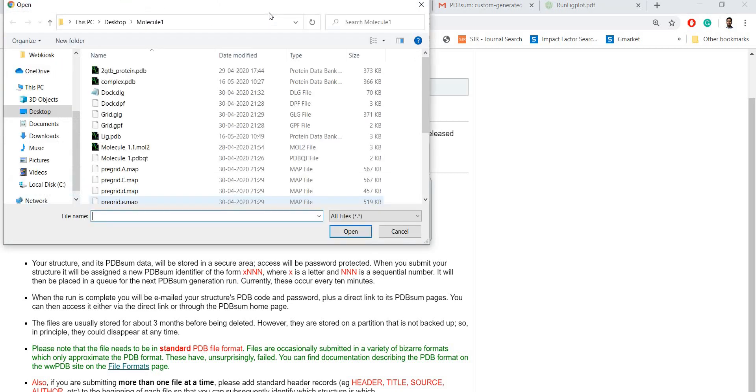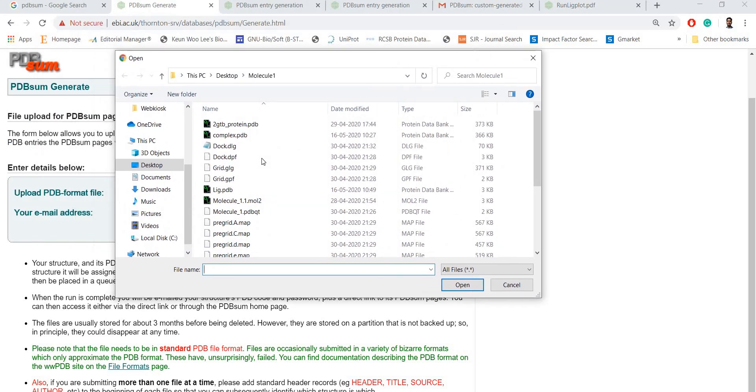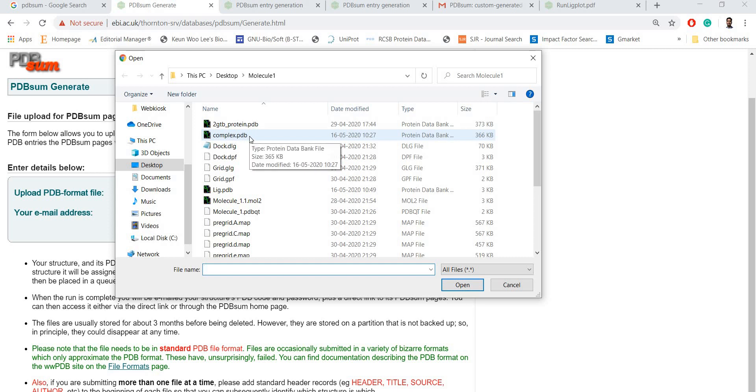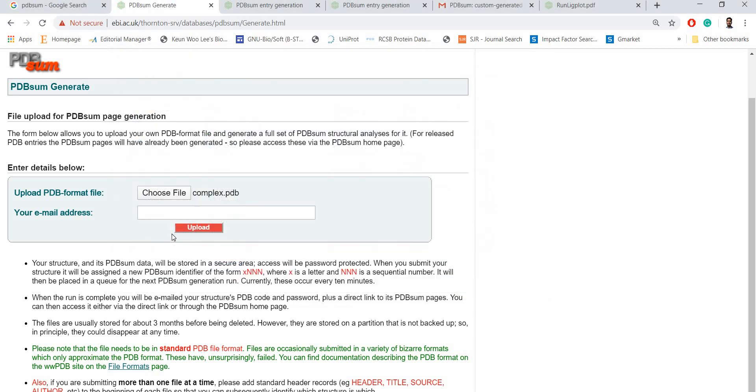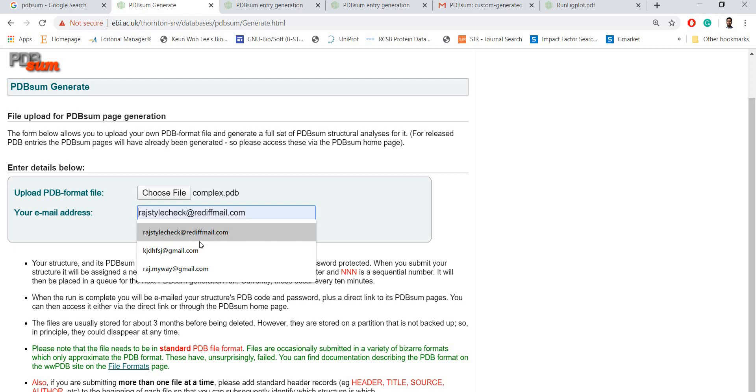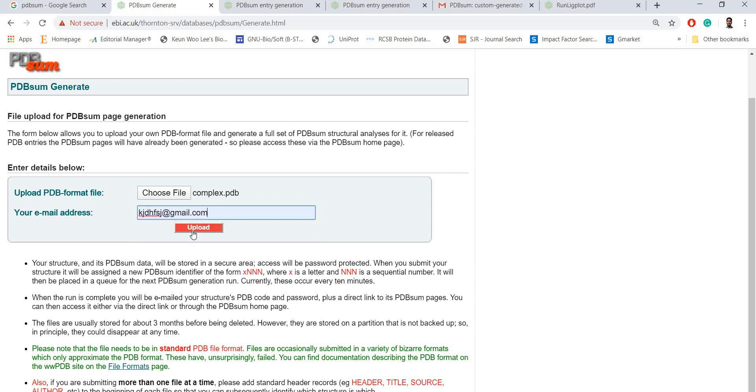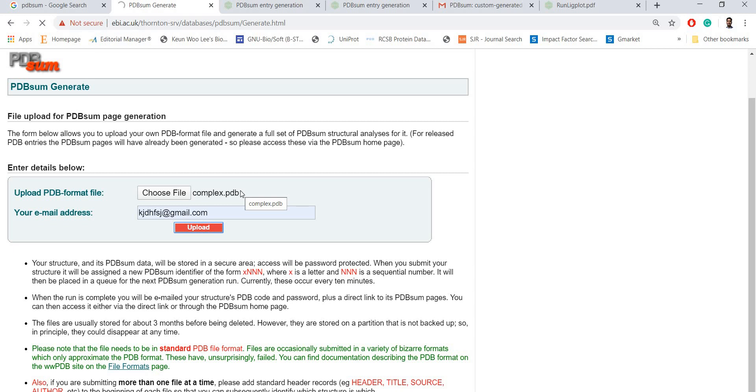Go ahead and choose file. You remember we saved a complex.pdb file earlier, so choose this one and give any email. Remember the results will go to your email. Just upload.